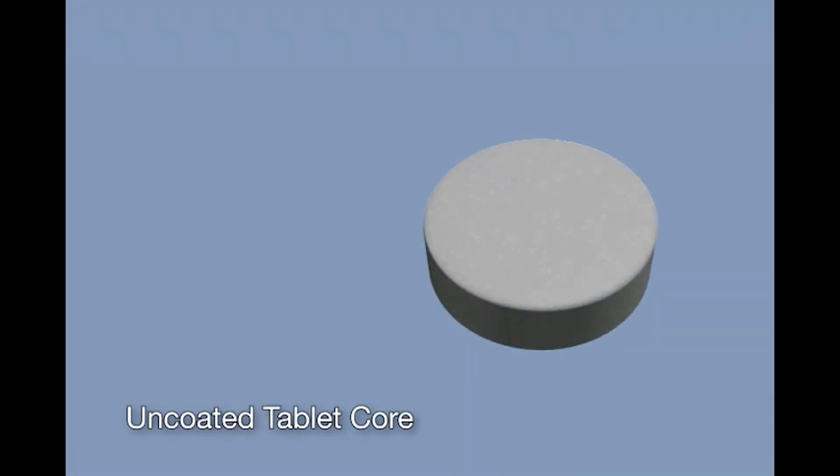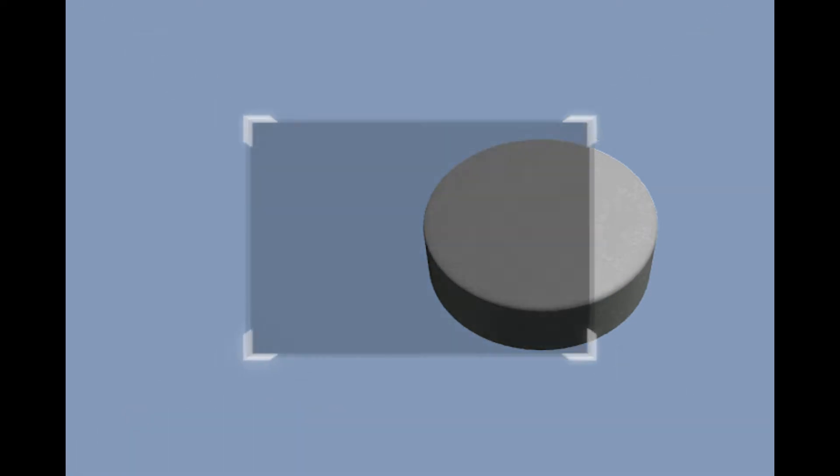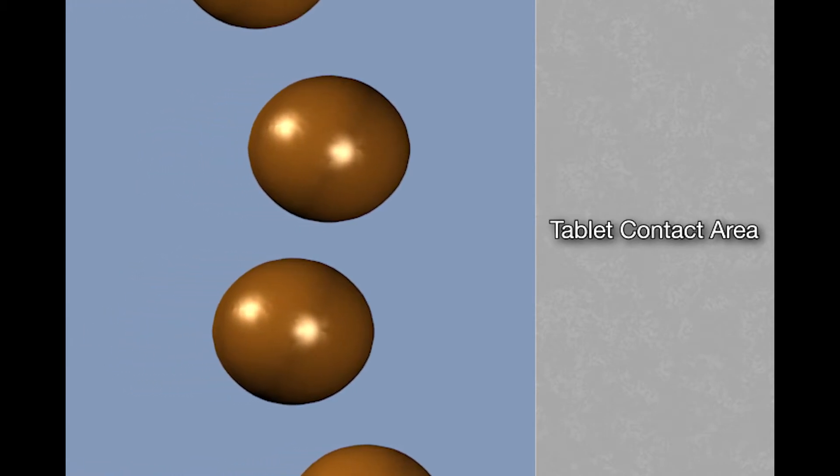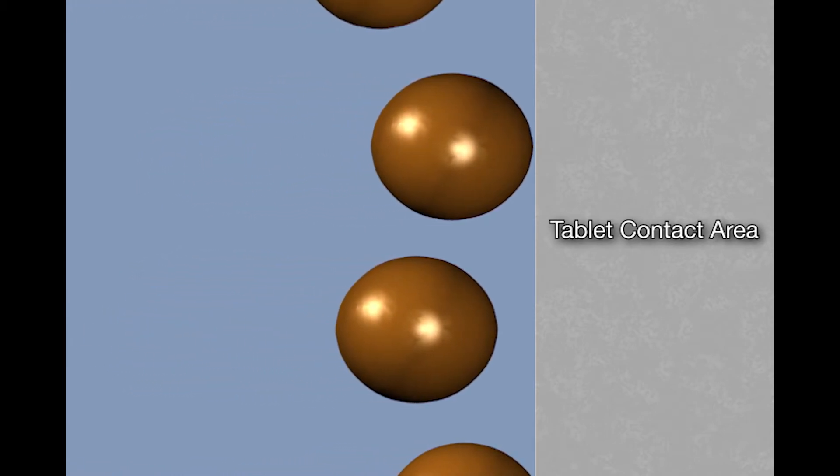The process of film formation can be viewed in three stages. An atomized droplet is applied to the tablet and moisture evaporates at a rate that is dependent on the air inlet temperature and humidity as well as the physical properties of the tablet and coat.